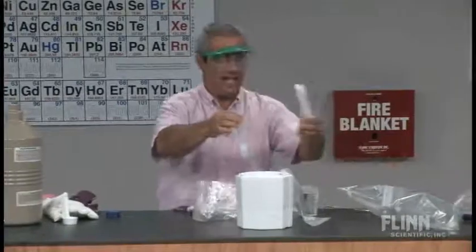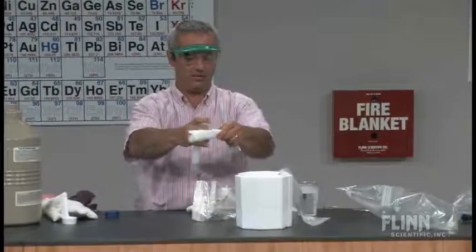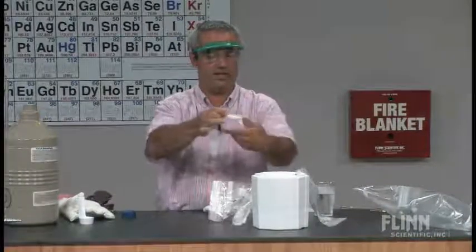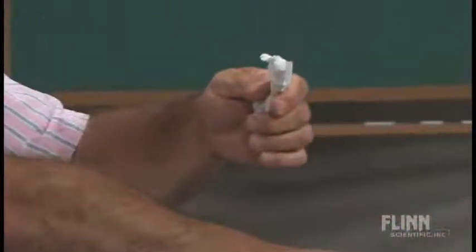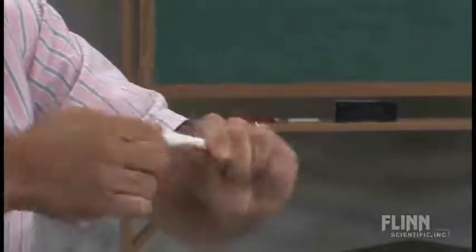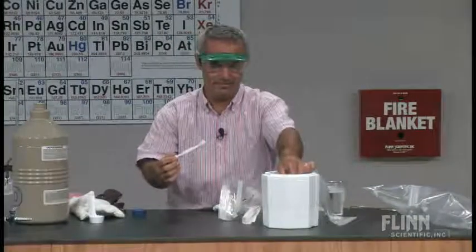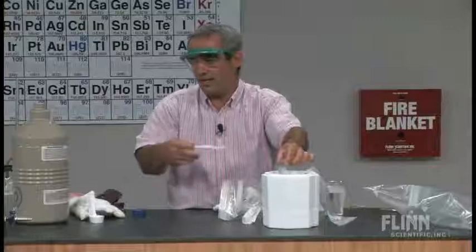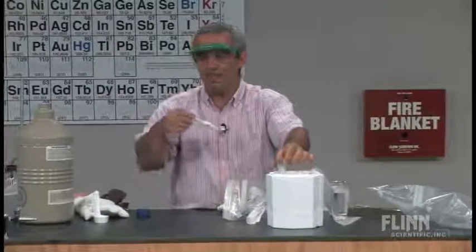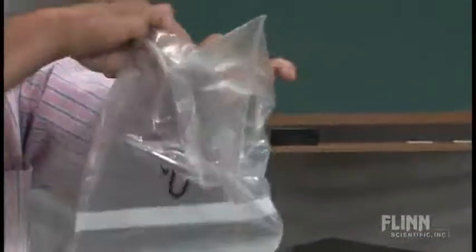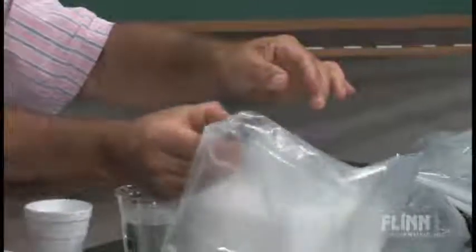Now, here's the neat thing you can do. I'm going to take a piece of paper towel, just a little bit smaller than the test tube, and actually, let me set this down in here. The top of these test tubes are not that cold at all. Paper towel burns, you know that. Would a wet paper towel burn? Hmm. No. Why? Because the water that is wetting it is blocking the oxygen from getting into it. But what if it's wet with oxygen? So, I'm going to stick this down in my liquid oxygen. I'm going to put the cap back on so I can kind of give it a little shake to get more of it wet.